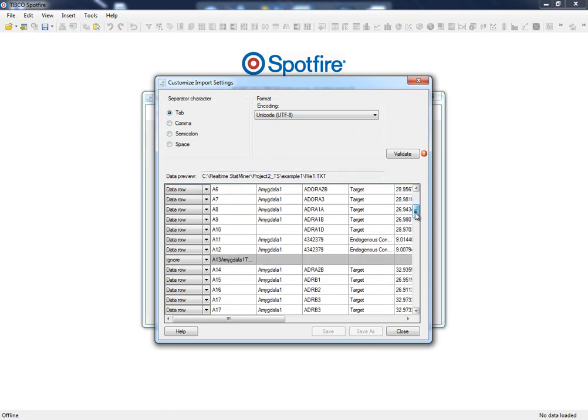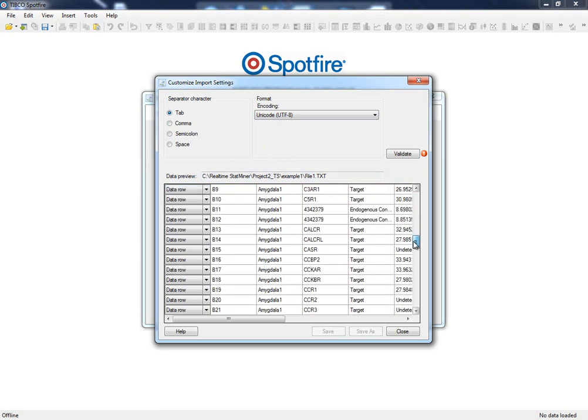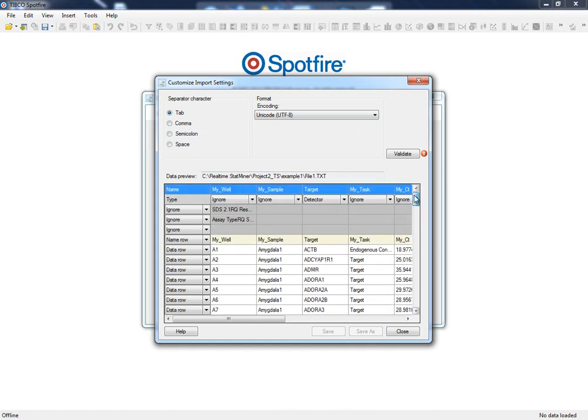This grid is a preview of around 100 rows of the first file we have provided. Assuming that all our input data files have a similar layout, we only need to configure this file and these settings will automatically be applied to all files when loading our data.